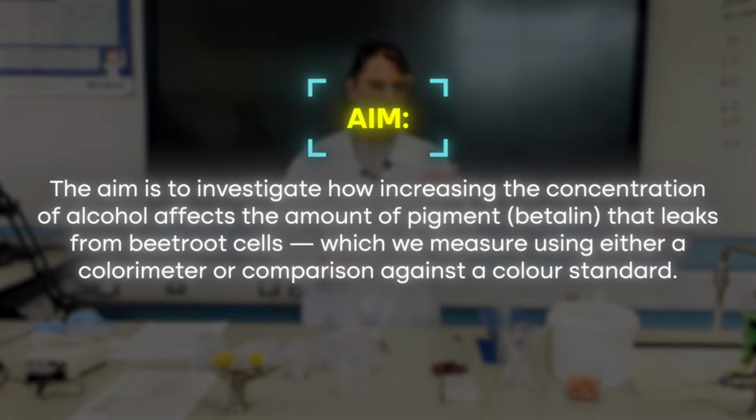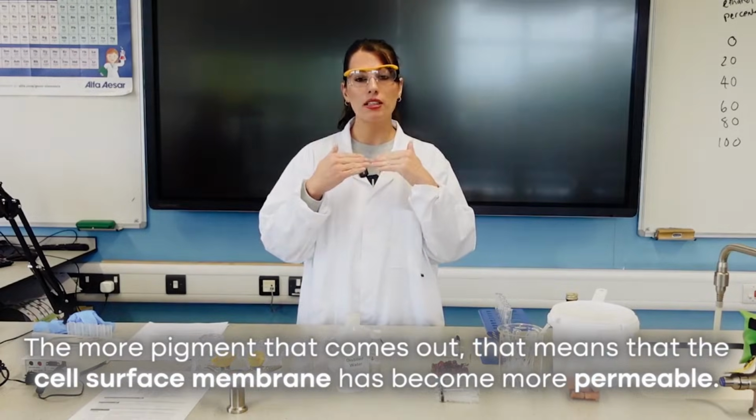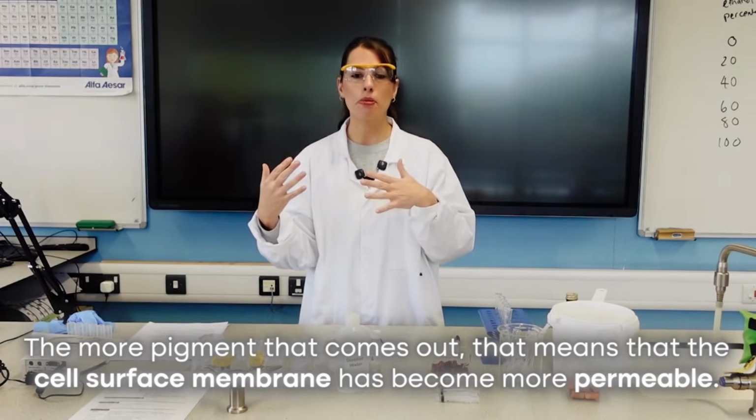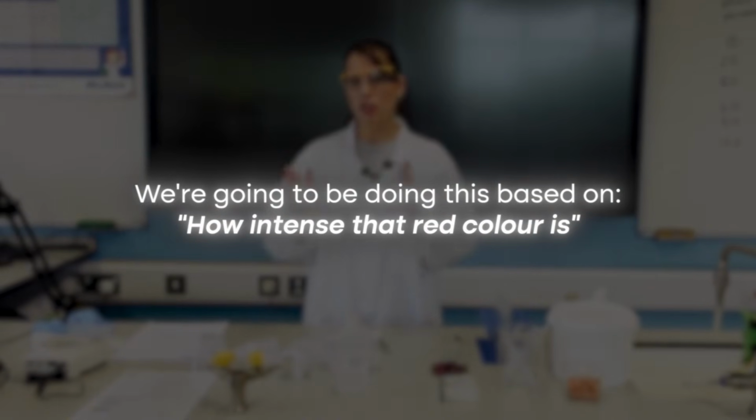And the way that we can measure this is by looking at how much of that dark red-purple pigment called betalain comes out of the beetroot cells into the solution. The more pigment that comes out, that must mean that the membrane, that cell surface membrane, has become more permeable. So we're going to be doing this based on how intense that red colour is.